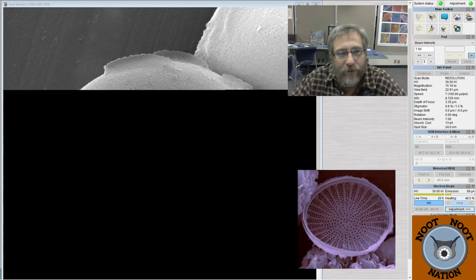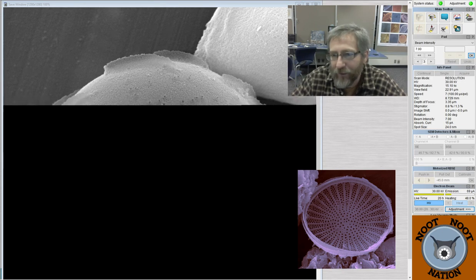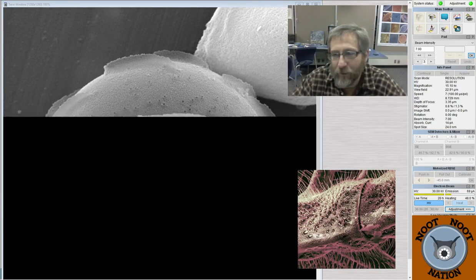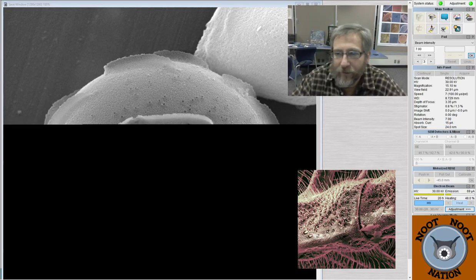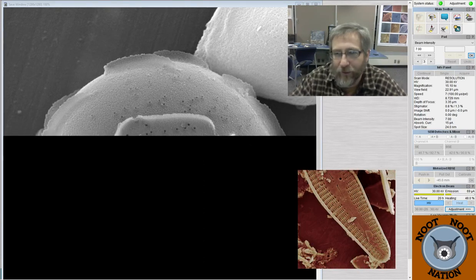Pandemic Watch, how's it going? I wanted to show you these Navicula and Gyrosigma that we found earlier. You weren't on yet. So now we're looking at a nice Surirella. Now we're looking at some chrysophytes, but when it's done, I'll see if I can find you one because you like those. Mystigan, good evening. It's just barely afternoon here.